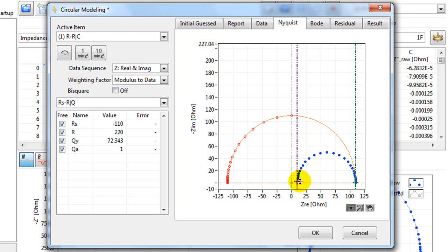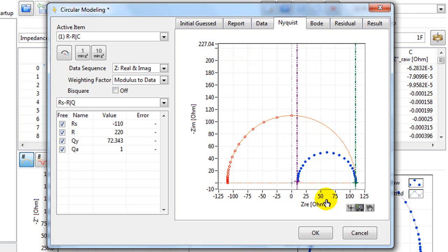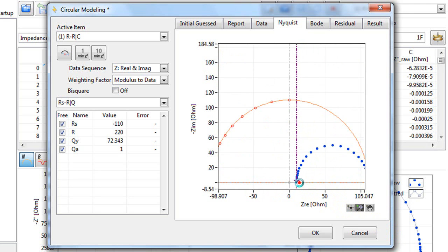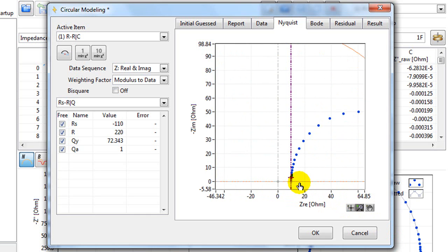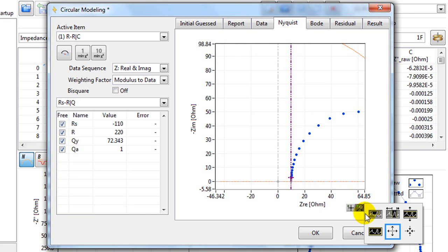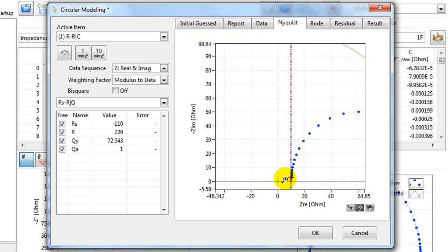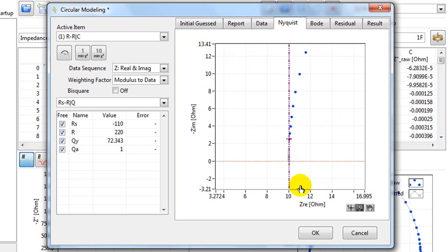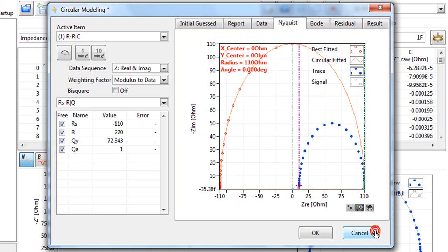To zoom into your data, you can use this zoom in function. If you click on this one and click on your graph, you'll see it zooms in. You can also select this to draw a square, to zoom in to see if it's still a circle. To zoom out, you can choose this to show all of your data.